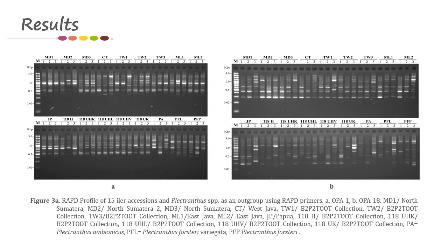A total of 52 amplified fragments were generated using 6 selected primers, of which 49 were polymorphic, with 94.23% polymorphism.